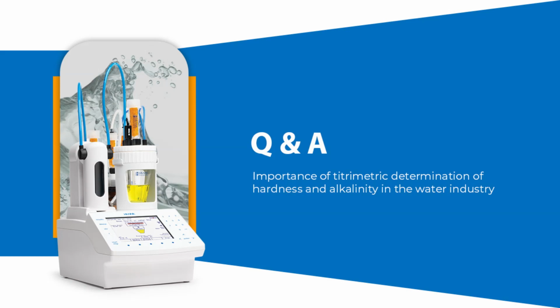Yes, sir, there is a direct procedure for the determination of COD by using the potentiometric titrator. So we have the method for direct determination for the COD. Because as of now, we use COD at higher temperatures, like 150 degrees centigrade for some 2 hours. Are those facilities available in the system that you have showed to us? Yes, sir. Actually, for the digestion process, you have to digest the sample at 150 degrees Celsius for two hours. That has to be done separately, and then we have to do the titrimetric final determination. Okay, I got it. Thank you.